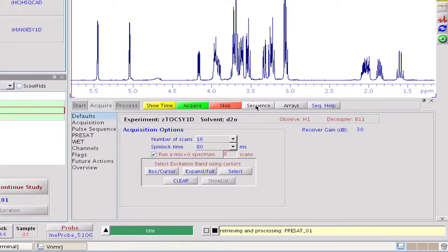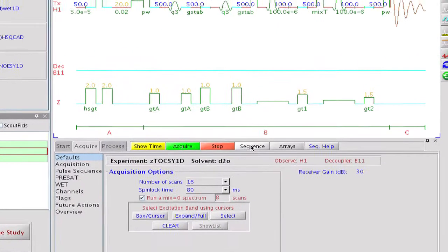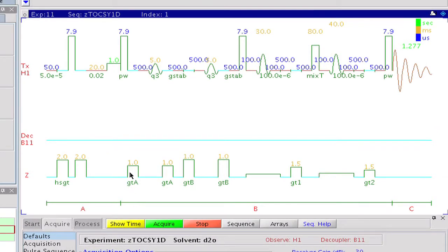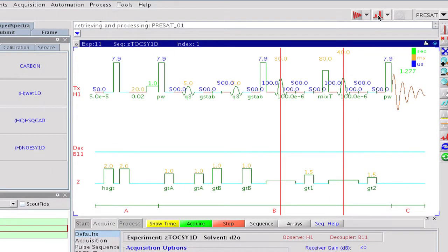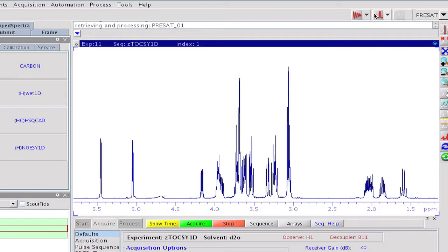In this particular implementation, selective excitation is achieved by a double-pulsed field gradient spin echo block incorporating 2 selective refocusing pulses on the target proton signal. It is followed by a DIPSI mixing sequence that transfers magnetization from the target proton to its scalar coupling partners. Mixing is flanked by 2 zero quantum suppression elements that filter out signals of a competitive process that frequently causes multiplet distortions.